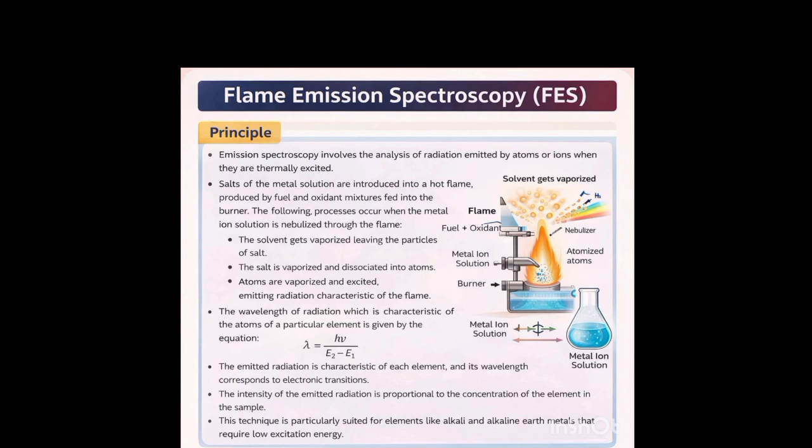The solvent gets vaporized, leaving the particles of salt. The salt is vaporized and dissociated into atoms. Atoms are vaporized and excited. The excited atoms emit radiation characteristic of the flame.